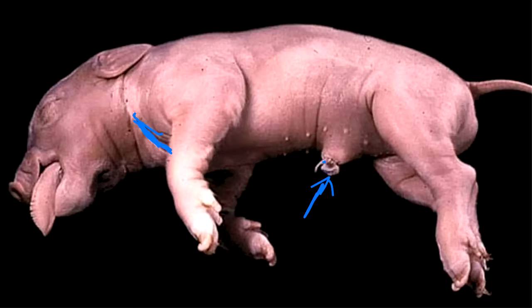what they normally do is they inject latex that's dyed red or blue into the vein, so that when you open the pig, you're able to tell, oh, the blue must be a vein. If it's red, it must be an artery. It doesn't work 100%, but for the most part, it does.